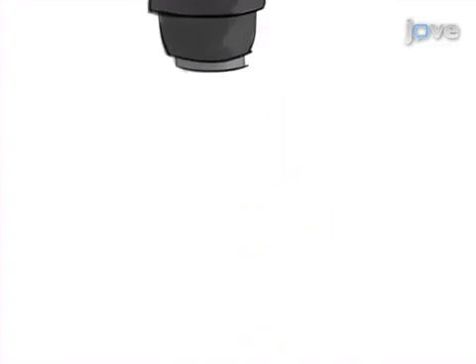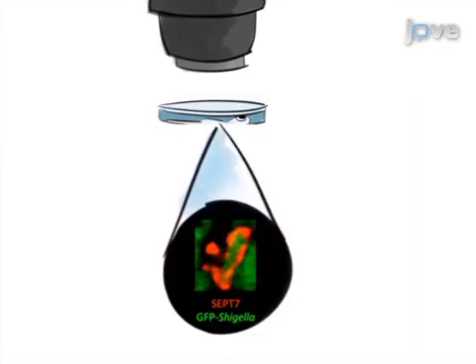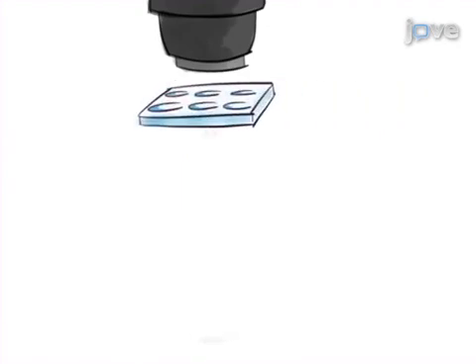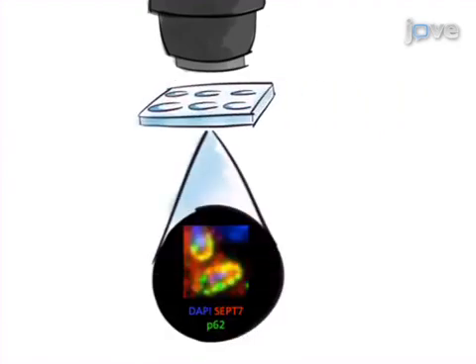For either method, the final step is to label tissues with autophagy and cytoskeletal markers. Ultimately, results will provide insights into the mechanisms required for the control of infection by cytosolic host responses.